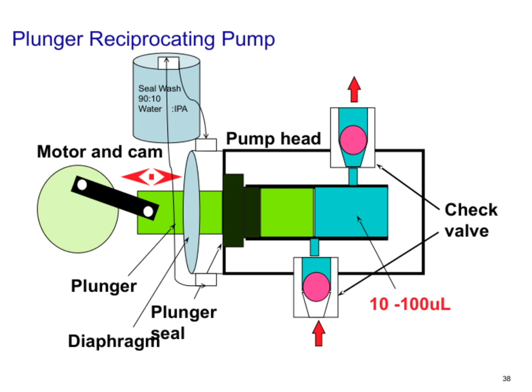Putting it all together, this reciprocating pump is designed for precision and reliability, especially in tasks requiring small volume handling. Every component plays a role in ensuring consistent flow and minimal contamination, which ties back to our overall theme of accurate fluid control in complex systems.